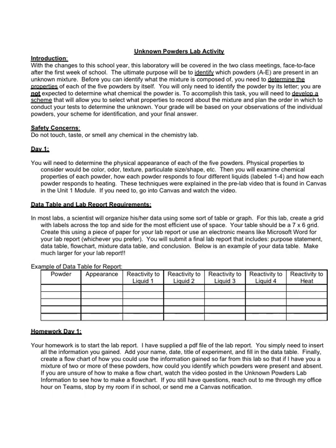Hello, this video is for you to understand. The goal here is for you to watch this video before you come to honors chemistry in the next week or two, depending upon when your cohort meets. The first lab of the year is the unknown powders lab, and the focus of this video is just for you to get introduced to what the lab is, what we're looking at, and what you're supposed to be doing when you show up.